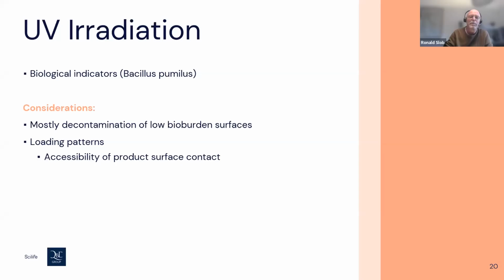It's also with loading patterns: you must be sure that everything is touched by the UV radiation, because otherwise, if you stack something on top of each other, it makes logical sense that the part which is under the other one will not get the exposure from the UV.